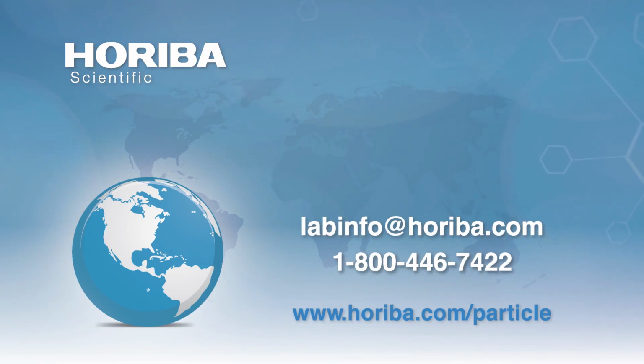So we don't need any background contrast really for measuring these particles, because where you come back to the example I said, but I didn't show an image of it, of something like fluid bed granulation, there is no contrast because there is no background. We just see a densely packed window of particles all up on top of one another. And in this case, the system has to be able to pick out the edges of particles in amongst other particles. Now, it doesn't have X-ray vision. It can only measure what it sees at the surface.